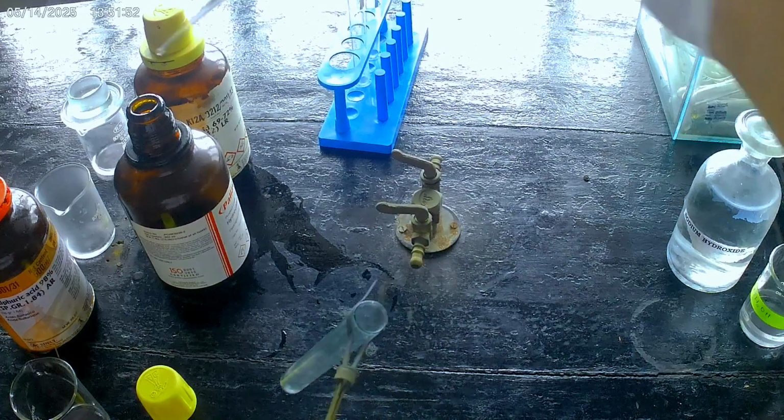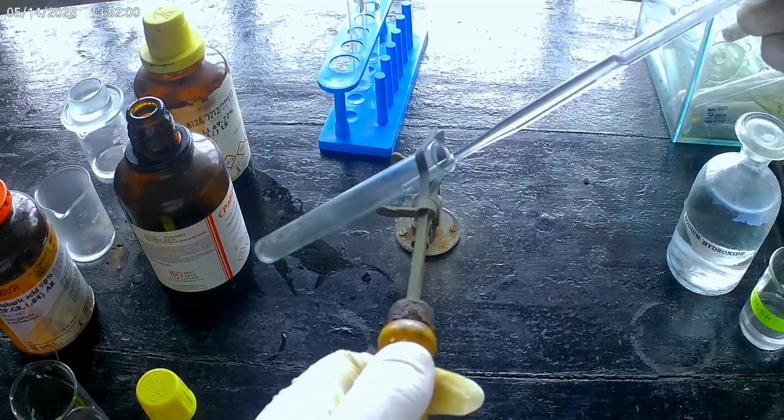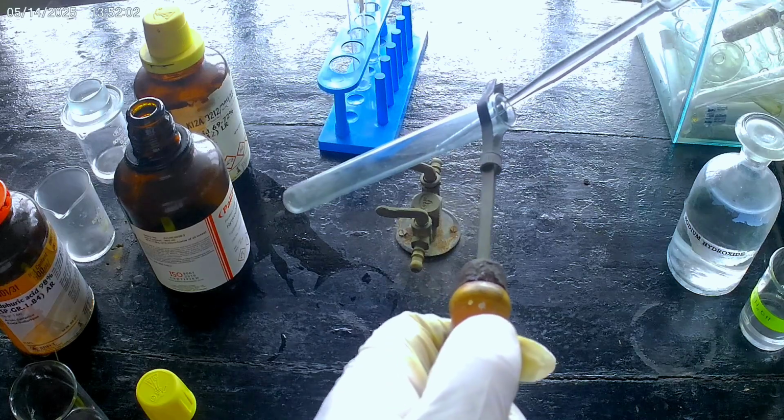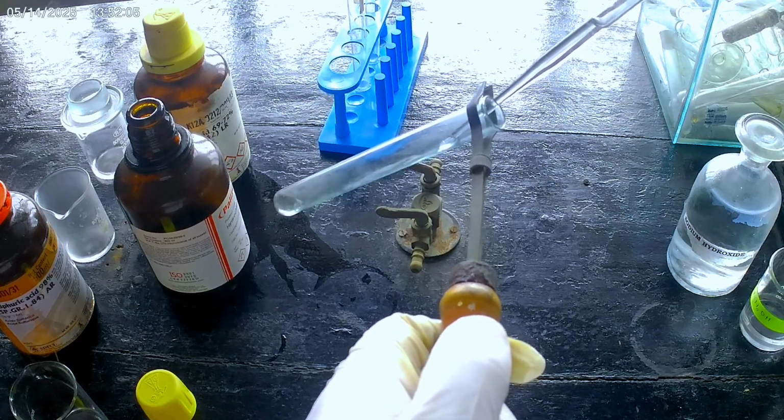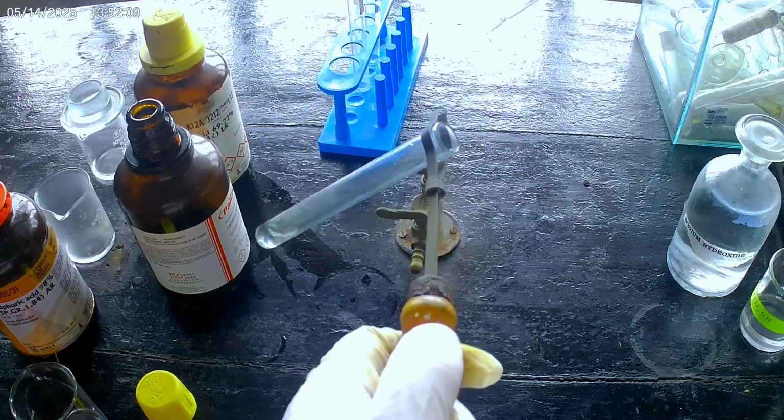Reaction of hydrochloric acid. So always remember, you have to use protective gear. And whenever you're pouring acids in a test tube, and this is your test tube holder, we have to tilt the test tube and pour the acid in this way. So here I am taking hydrochloric acid.